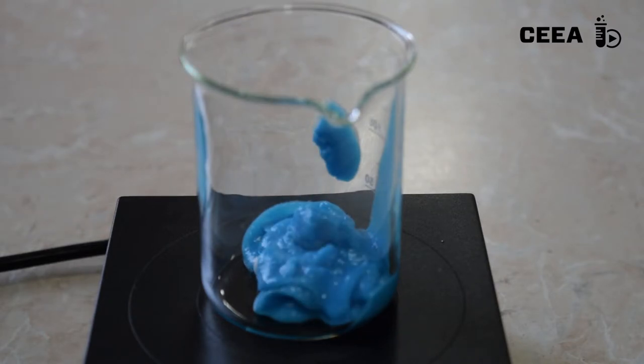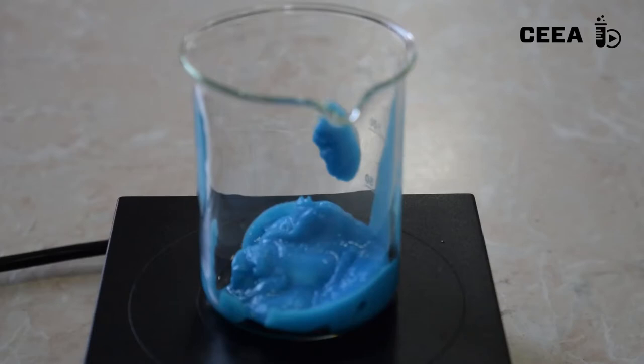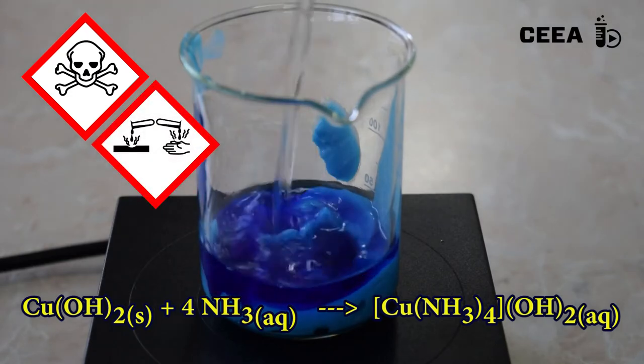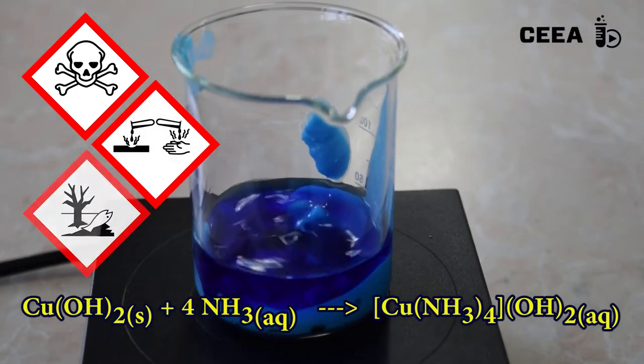Once filtered, place the precipitate in a beaker and add 50 ml of concentrated ammonia until the complete dissolution of the copper hydroxide.